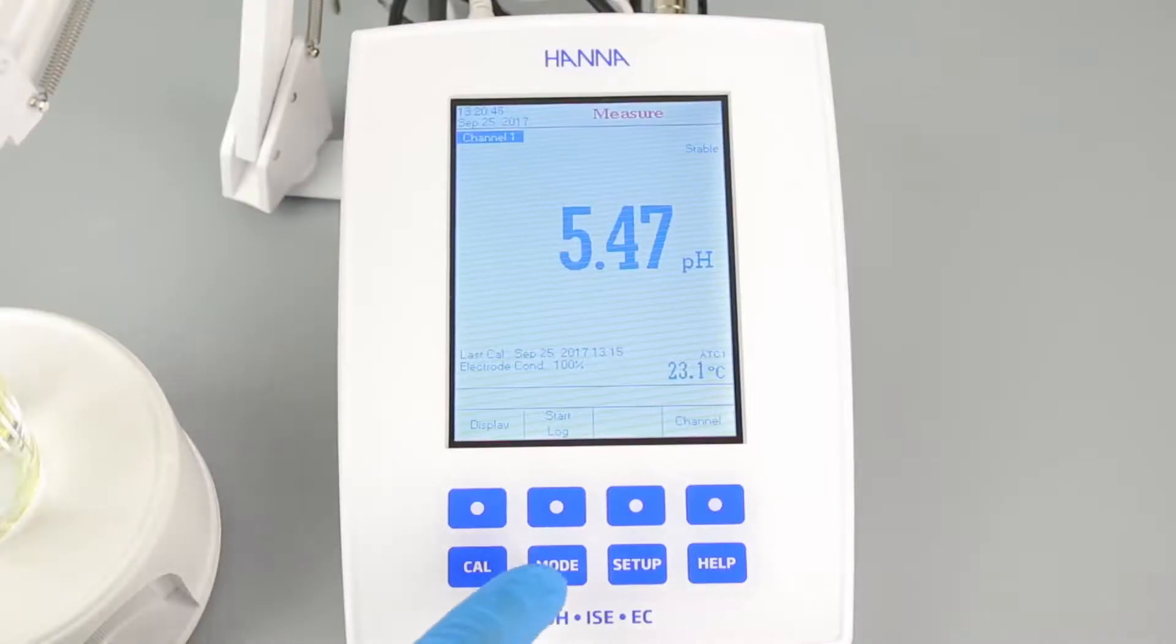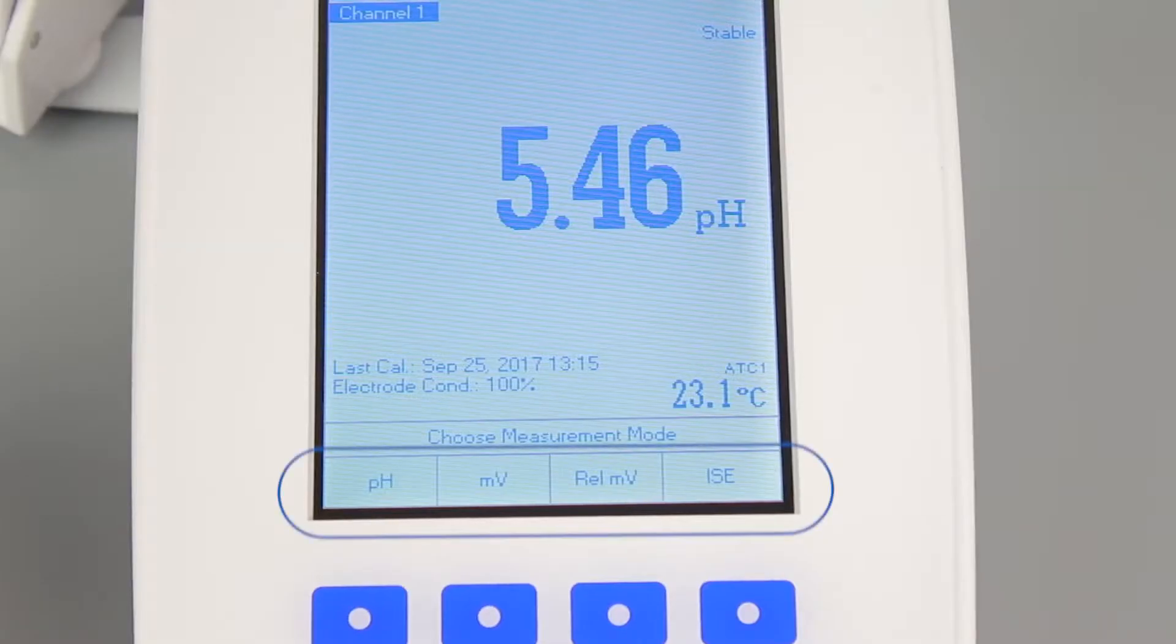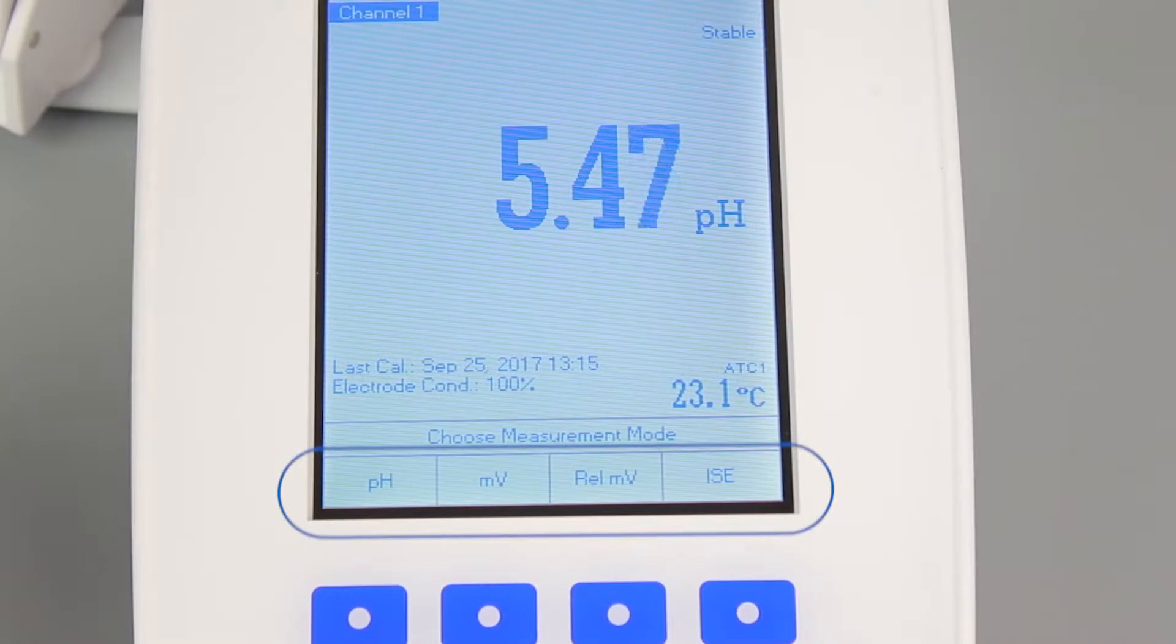Place the electrodes into your sample and wait for a stable reading. Once stable, you can press MODE to switch between pH, millivolt, relative millivolt, and ISE.